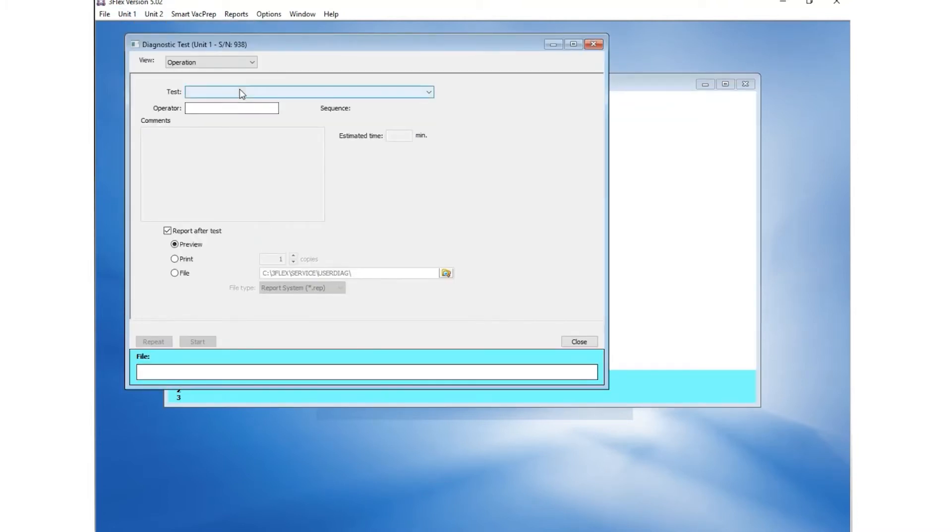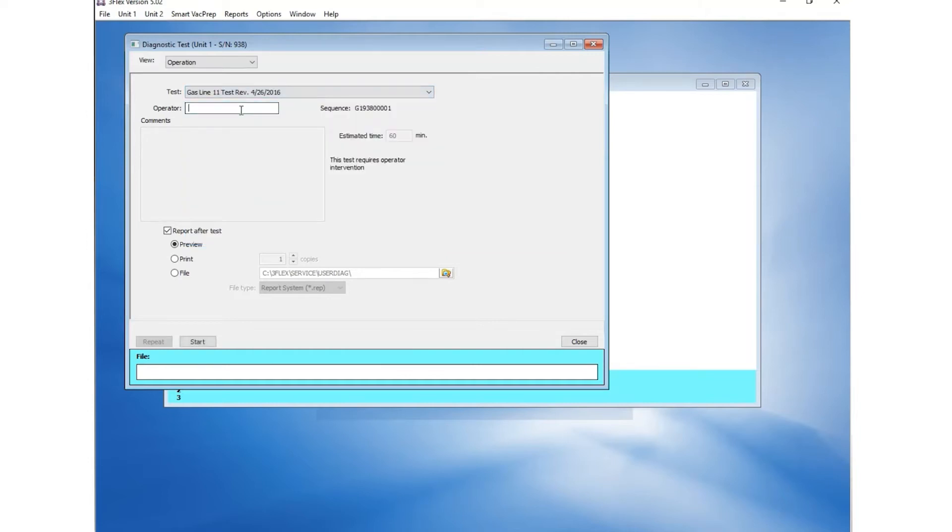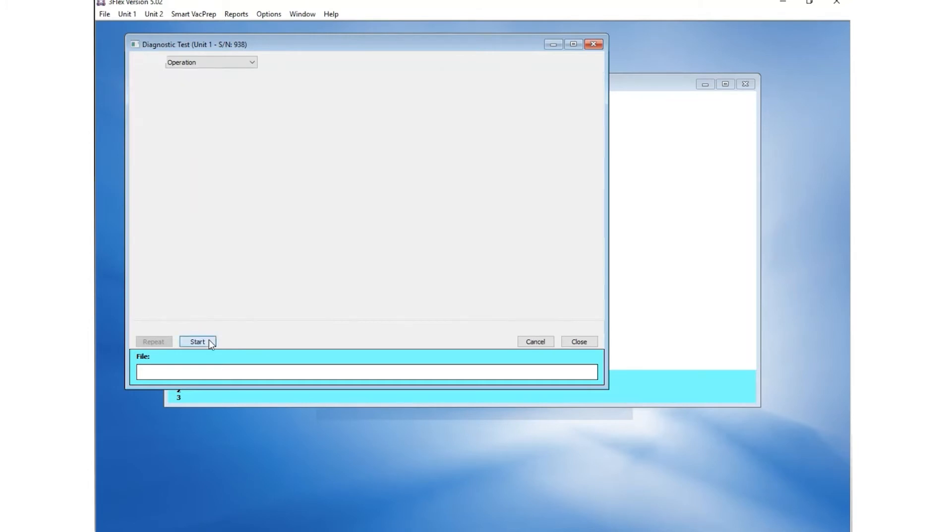Click Test and select the corresponding gas valve number to perform the test. Enter the operator's initials and check Reports After Test. Click Start to begin.